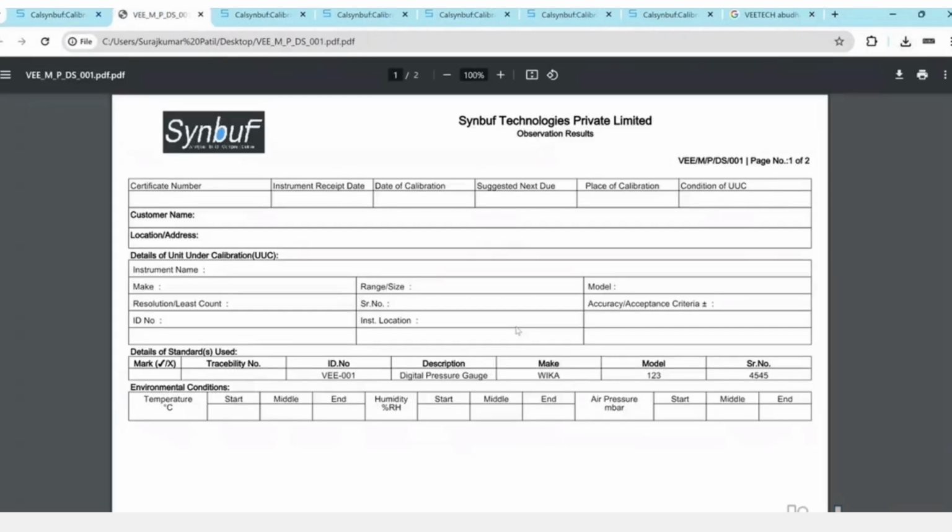So this is my normal format. You see, the format code is printed here. This will be your company name, company logo, etc. All printable formats will be delivered to you in your style. Minor mutual understanding we need to do, but 99.99% it will be matched.